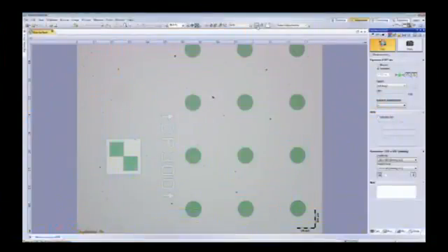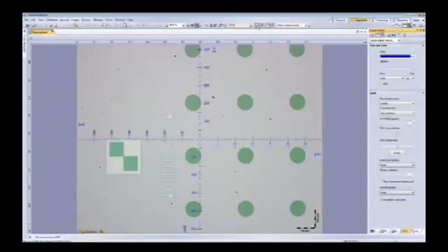One other new feature added on the screen for live quick measurements is a digital reticle. Oh, that's cool. A lot of customers ask for this where they can be on a live image like we are. Now this scales as you change zoom factors and so forth, or lenses? Exactly. So if you're integrated with the microscope, which our software integrates with a lot of our scopes, like this one here, it's a coded nosepiece. As soon as you change objectives, it's going to modify and change the scale on the screen.